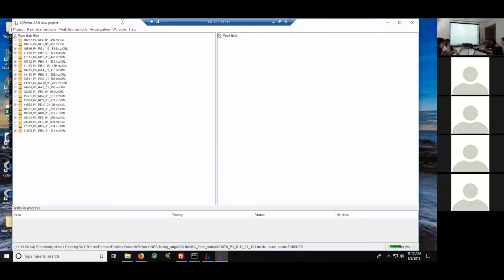When I browse to your folder, I don't see it. I want to try and put them on my desktop. Where can I find your desktop here? It's right here. Okay. Sometimes the volume just happens on my computer multiple times. Where do you want to put them on your computer? Now it's 22 files. Okay, that looks better.